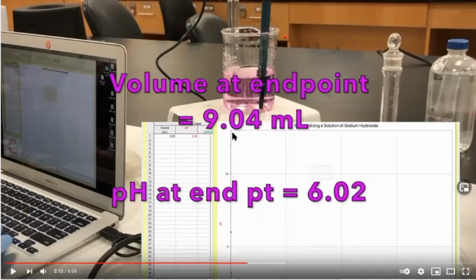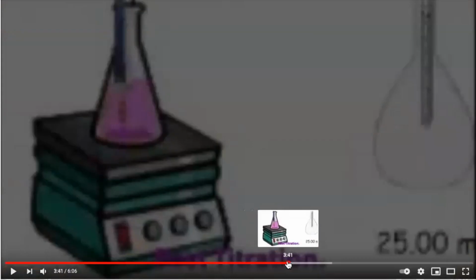Notice it's much less than method 1. Why? Because we're only titrating 1/10 of that mass that we weighed out. We're only taking 25 mL of that 250 mL. So of course it's going to require less volume. Anyway, that's the data that you guys would use. And then here is, again, the procedure.